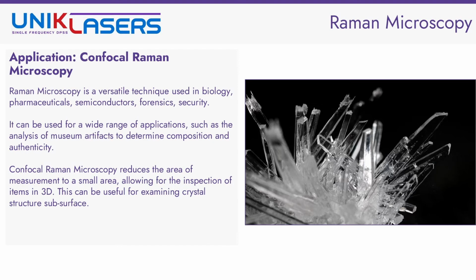A more advanced method of Raman microscopy is confocal Raman microscopy, where you combine the abilities of a confocal microscope, which limits the acquisition area to a small 3D volume, with the Raman technique. This can allow you to measure in 3 dimensions the signal from the sample, allowing you to go subsurface. For example, maybe you've modified a crystal and you want to measure how this has changed with depth.